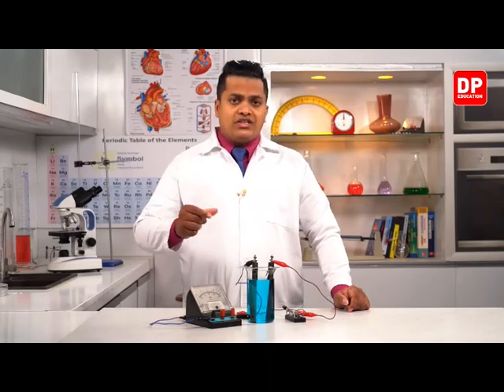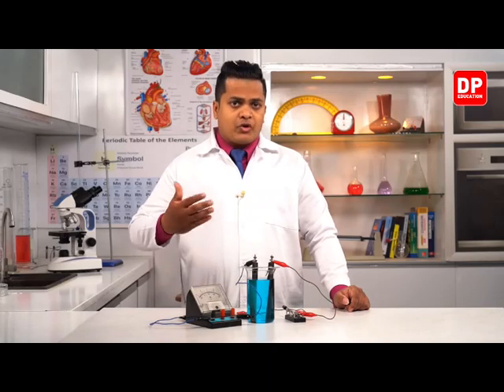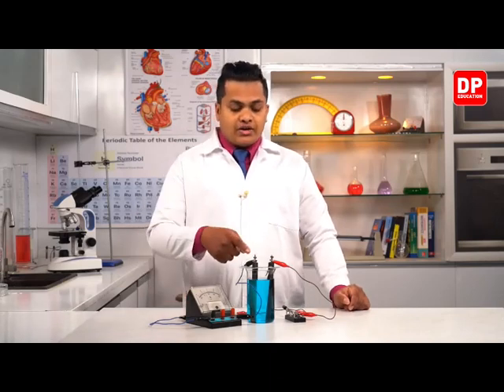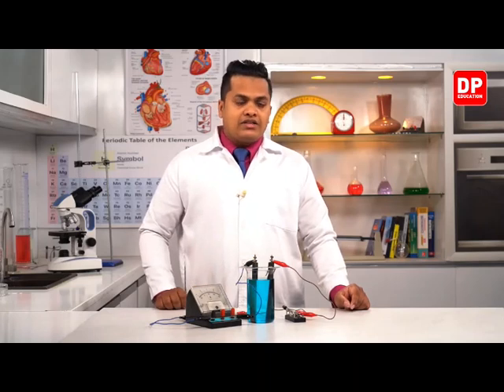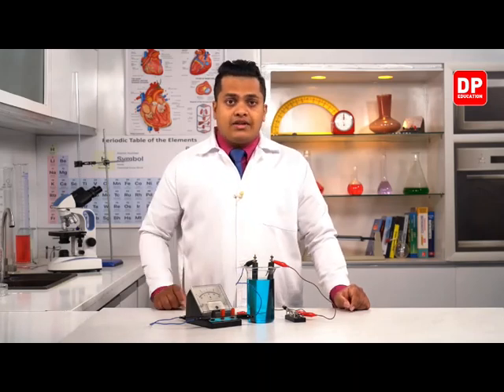Then afterwards, we'll observe what happens with the color, and I'm going to take out the negative terminal. I'm going to show what has happened to the negative electrode which is inside the copper sulfate solution. So we'll keep the system for a while and observe what has happened with the color and with the negative terminal of the setup.